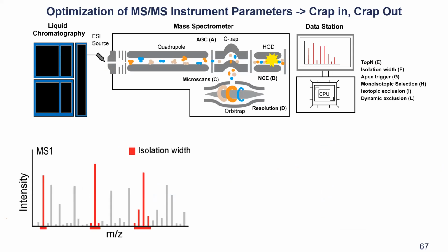Okay, and then last but not least, the isolation width might also be quite important. As you know, you can set the quadrupole, and I think there are particular differences in capability between vendors, and sometimes this simple quadrupole at the beginning is forgotten, though there may be quite some differences in the actual performance. And this goes very much together with your MS/MS quality downstream.